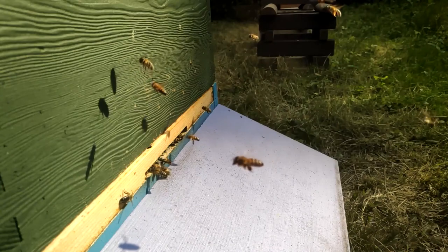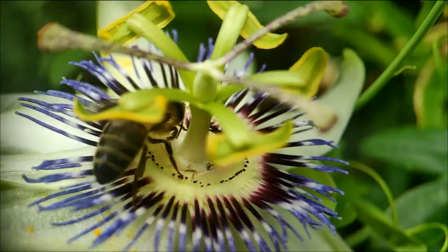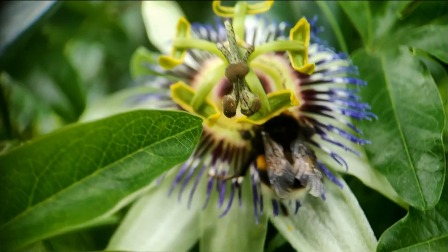I had an old camera that I could smash up and get the lenses from, and also an old laser pointer I confiscated off Katie's elder brother, and got the little lens out. Apparently you can stick two of those together and you might even be able to see down to cellular level. The quality is a bit iffy, but putting all those together and creating a little system creates something beautiful. Modern smartphones don't have to be expensive — this is a Pocophone F1, 200 quid when I bought it, and you can buy one secondhand for 50 quid now. The cameras are fantastic. I've taken slow motion pictures of insects, flowers flying around, all kinds of things. I've also got this little macro lens you can fit on them — only a few quid. So it gives you some ideas of what you can do exploring the natural world, learning and getting some amazing shots. So have fun, get building, enjoy.